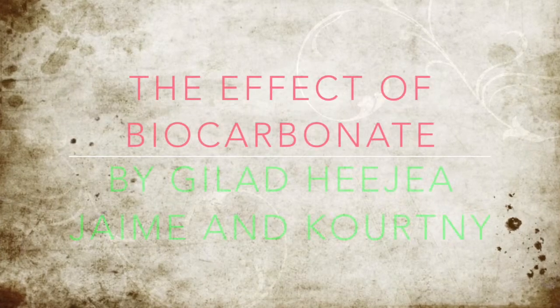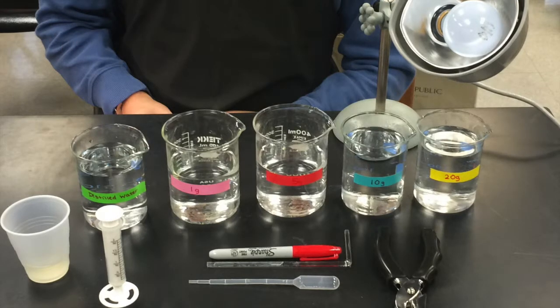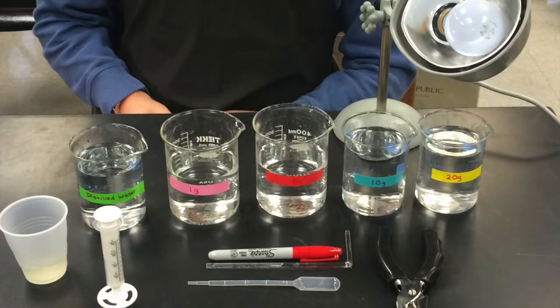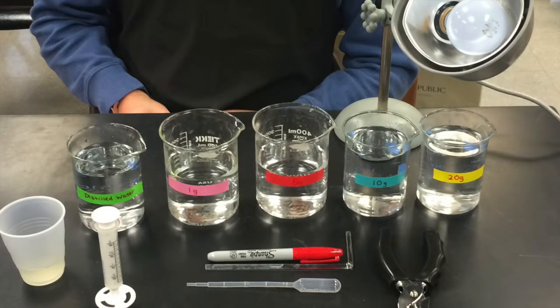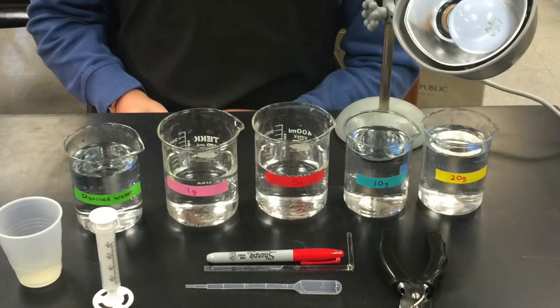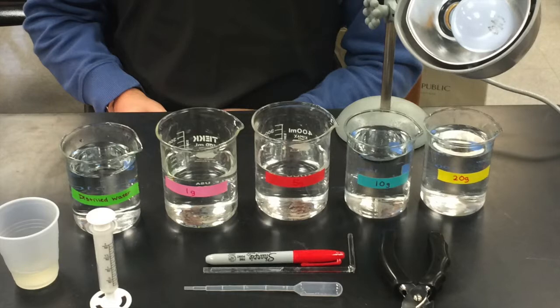It's been a long road. In our experiment, we decided to investigate the effects of the level of CO2 concentration on the rate of photosynthesis. Our hypothesis was that the rate of photosynthesis would increase with increasing CO2 concentration, since CO2 is a necessary reactant in the photosynthesis reaction.